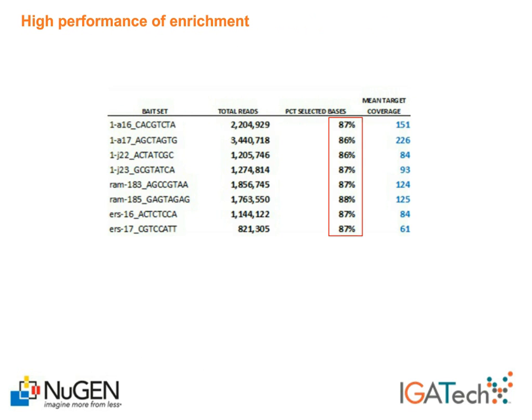So with the first data back from our lab, we assessed the percentage of enriched bases, or in other words, how many reverse reads aligned on the probe regions originally designed. Data showed that this enrichment system, which here was applied in an interspecific context of Populus nigra based on the Populus trichocarpa genome, outperformed standard hybridization-based systems we have worked with so far. Even when using curated probe sets in model organisms such as human, we never saw such a very high percentage of enriched bases.